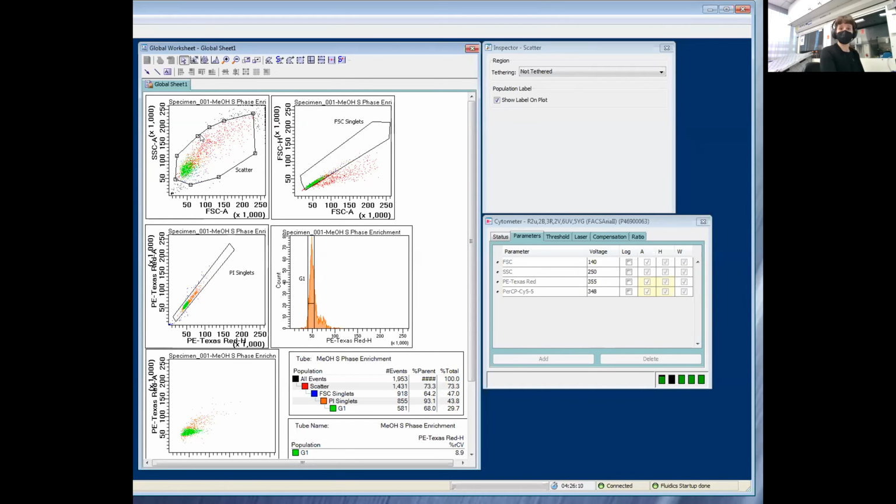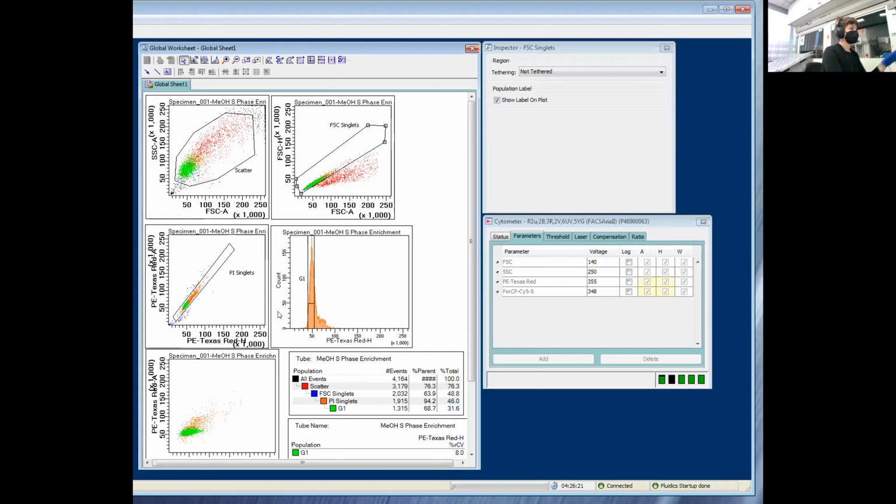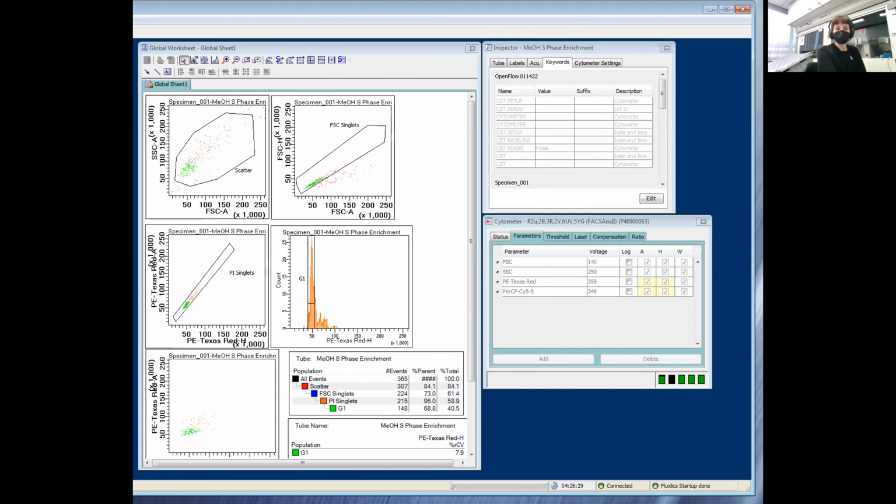So that's something you also want to be on the lookout for as you carry out any type of treatment to the cells, because you're going to have to modify your scatter gating, your singlet gating, to make sure that you're actually seeing and recording the populations you expect. And sometimes these treatments are a little bit difficult, and you don't see that really clean pattern. That's why having the controls in place is really important, to make sure that we're confident about our analysis.